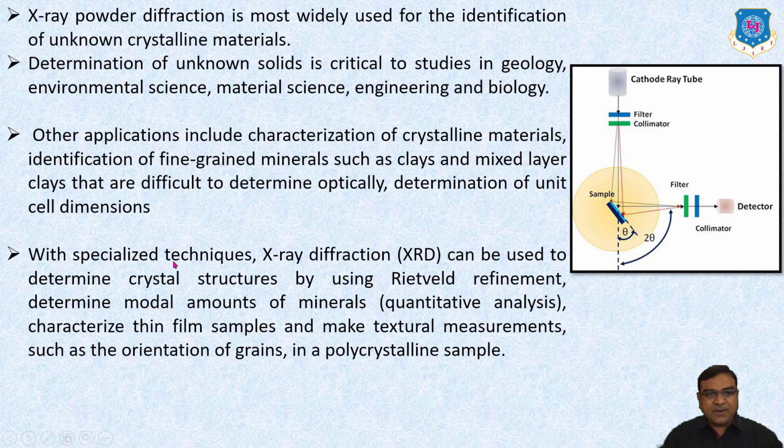With specified techniques, X-ray diffraction, XRD, can be used to determine crystal structures by using Rietveld refinement, determine modal amounts of minerals, that is, quantitative analysis, characterize thin film samples, and make textural measurements such as the orientation of grains in a polycrystalline sample.